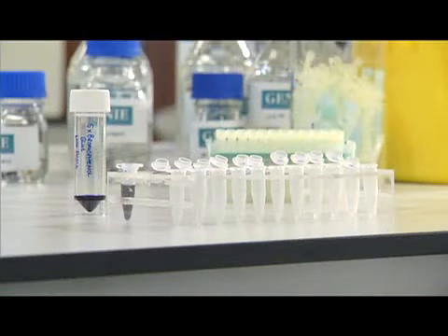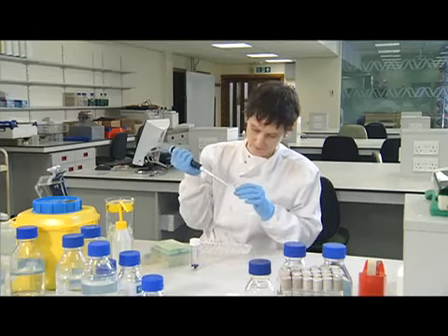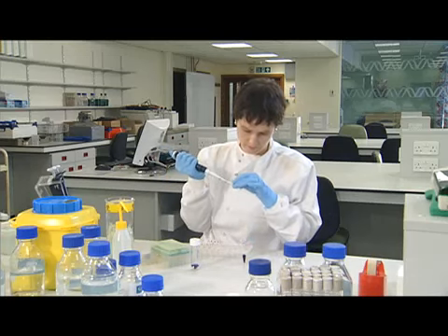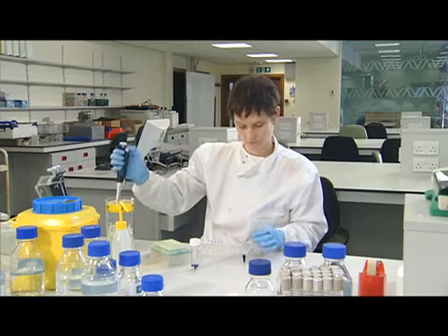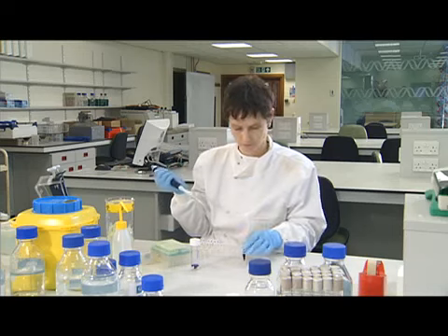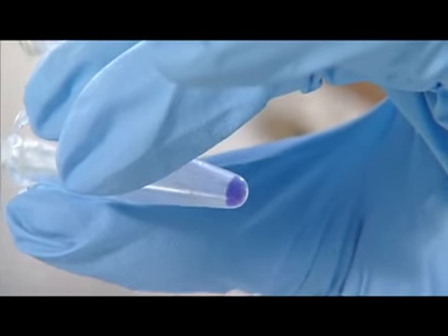Before loading nucleic acids into the wells of a gel, you need to add coloured loading buffer to the samples. Different coloured dyes can be used, but one that's commonly used for this purpose is bromophenol blue. The loading buffer is made up of dye and a glycerol or ficoll solution. The dye colour helps to visualise the loading of the samples into the wells and helps to keep track of the migrating samples. The glycerol or ficoll makes the samples heavy so they sink to the bottoms of the wells. Ensure the loading buffer and the sample are mixed so the solution has a uniform colour.